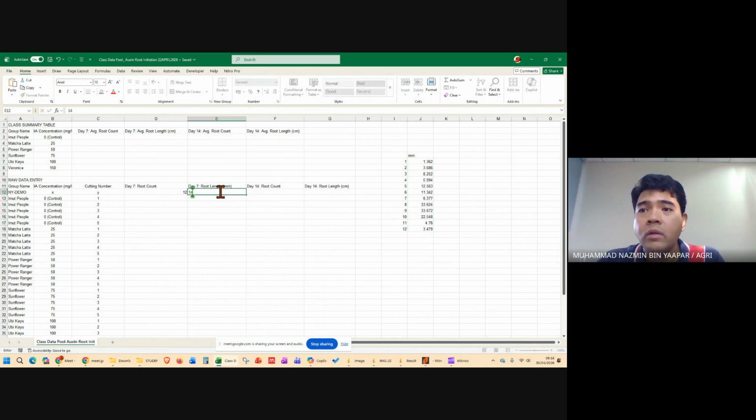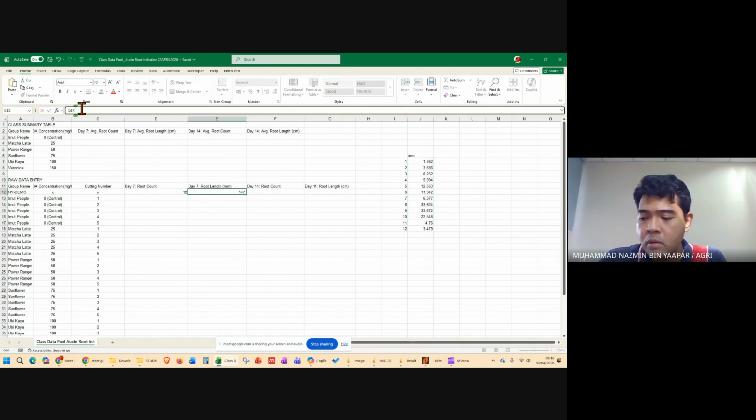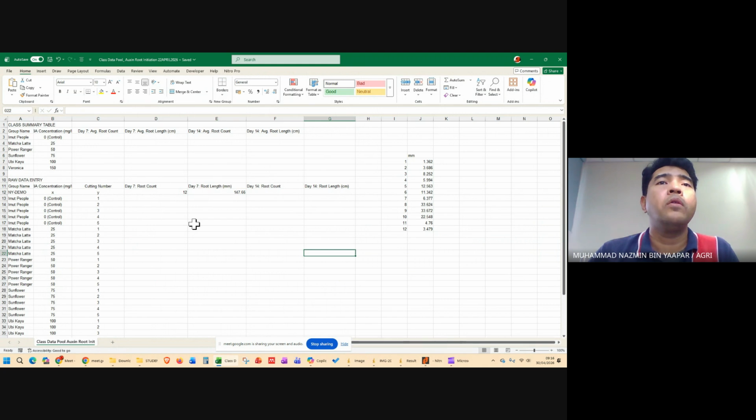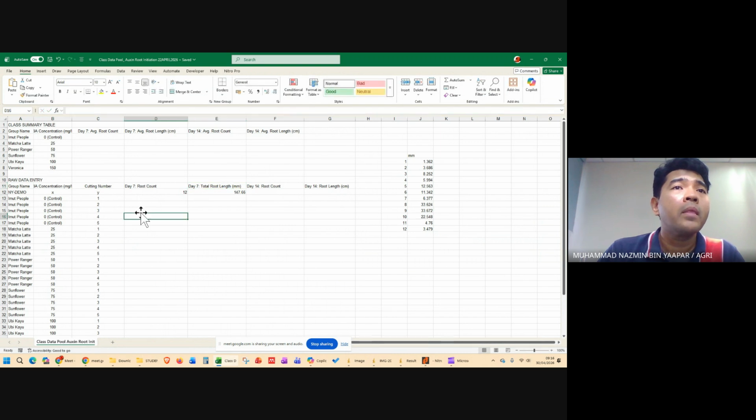Oh, I forgot. Let me run it off. Okay, right. Total.